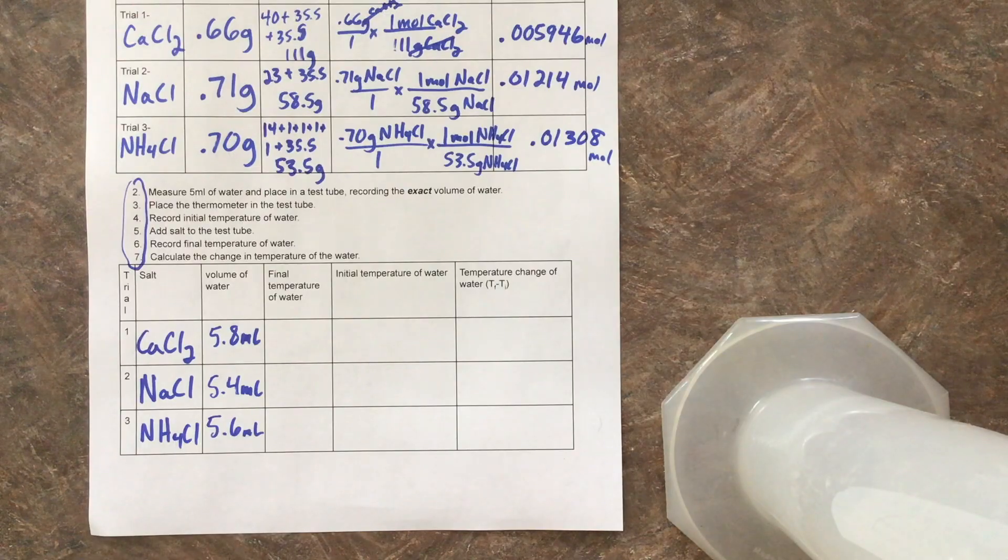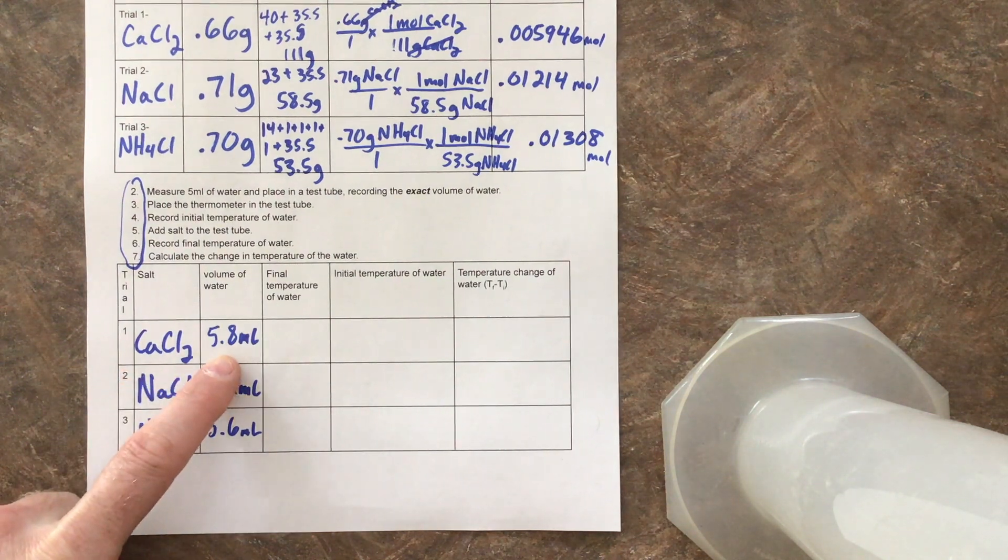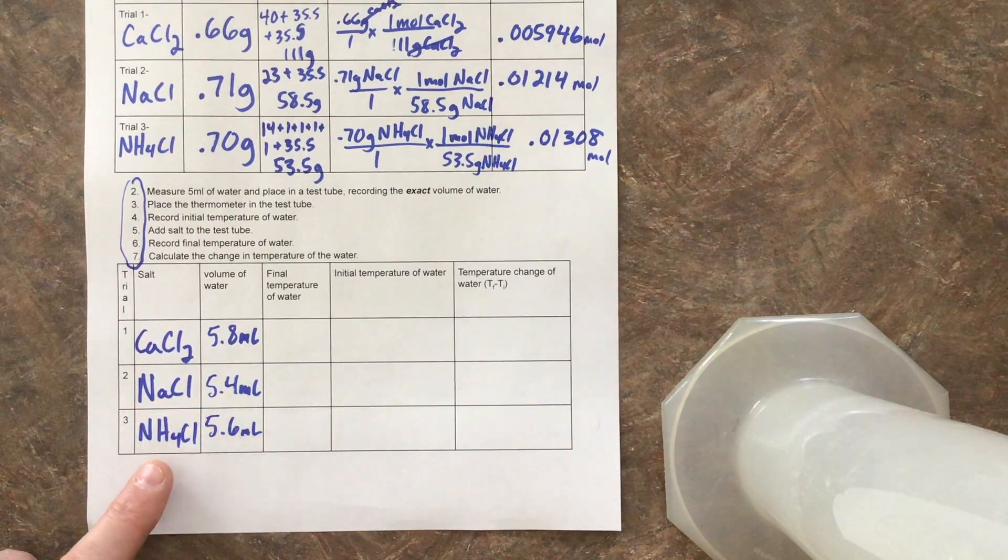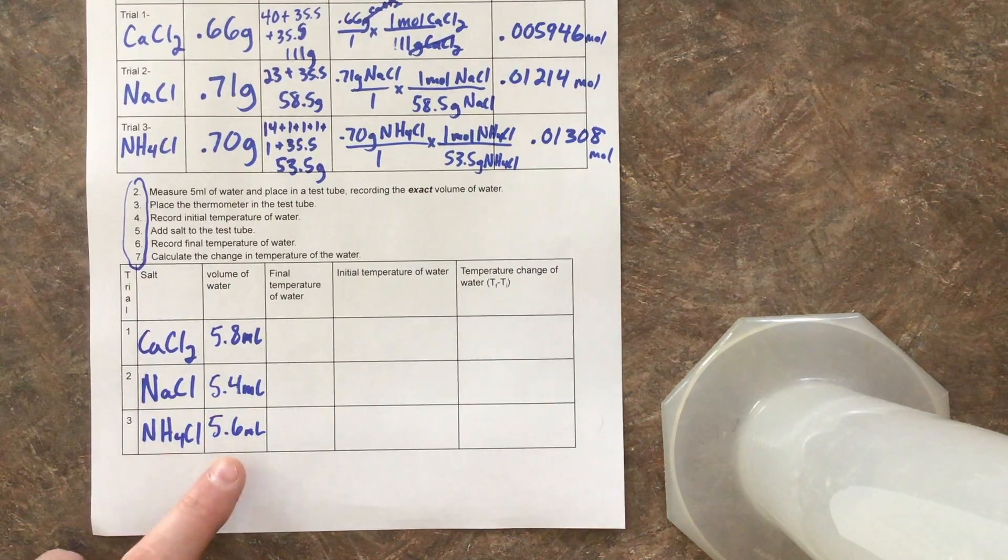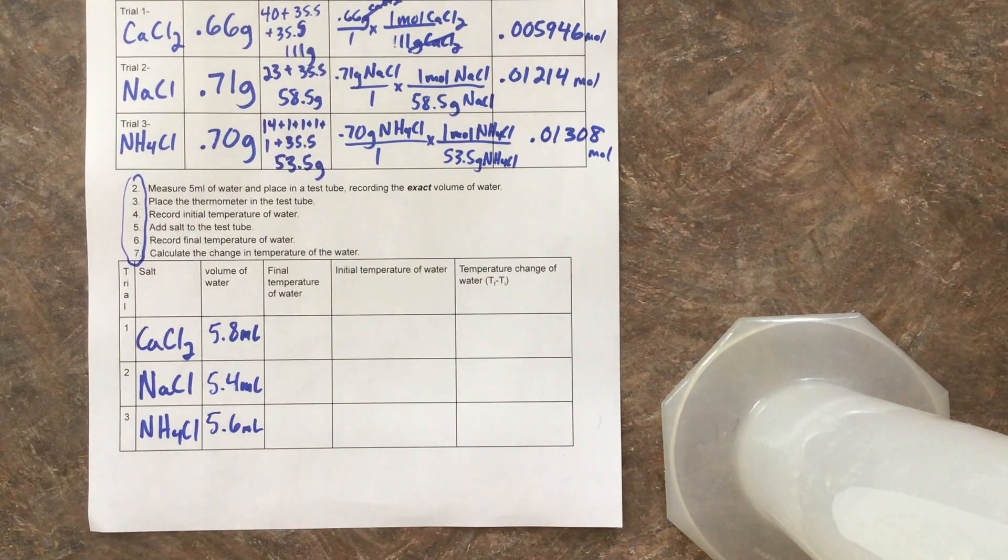You can see how I've got the salts set up. The one on the furthest left, that's going to be our calcium chloride. We have 5.8 milliliters of water for there. Our sodium chloride is in the middle at 5.4 milliliters, and our ammonium chloride is on the right at 5.6 milliliters. Now let's go ahead and check out what is our temperature reading with the thermometers.